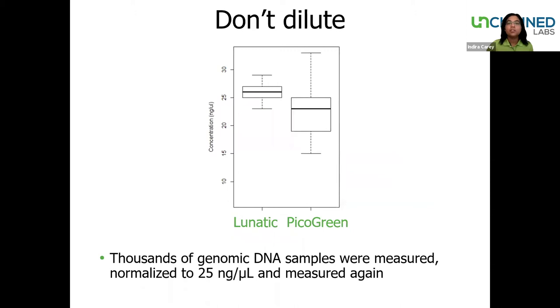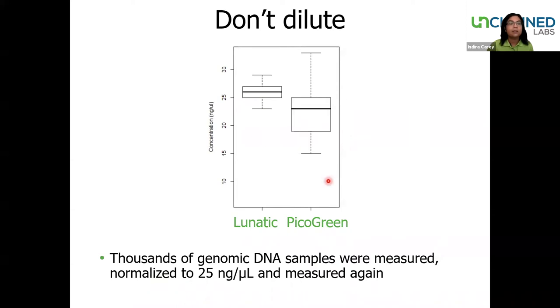This example shows the impact that multi-step procedures have on readout accuracy. This experiment was run by one of our high-throughput customers, and what they did was to measure thousands of genomic DNA samples using either Lunatic or PicoGreen. Based on those results, the samples were adjusted to 25 nanograms per microliter and read again. You can see there's a much wider variation in the results with PicoGreen compared to the samples that were read on the Lunatic.